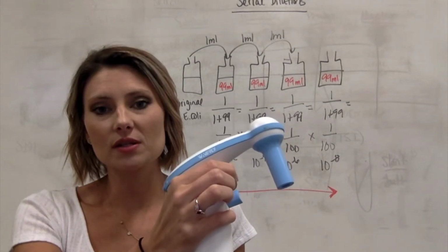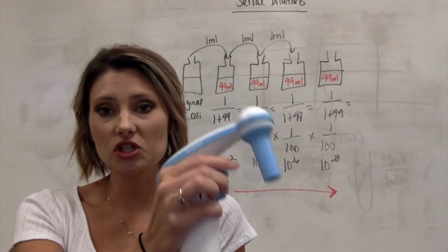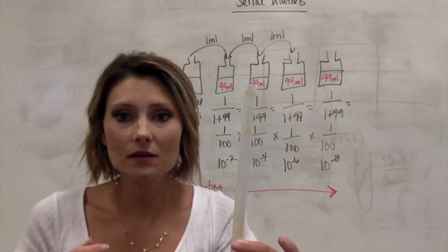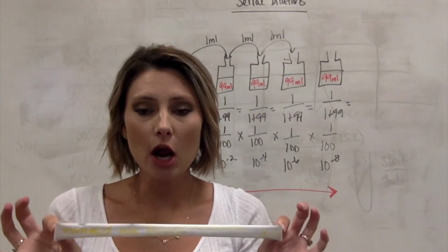So whenever you press the top button, it sucks up. When you press the bottom button, it pushes the liquid out. And then you need your pipettes, okay? So you're going to be sucking up liquid, so we're going to be using our pipettes.